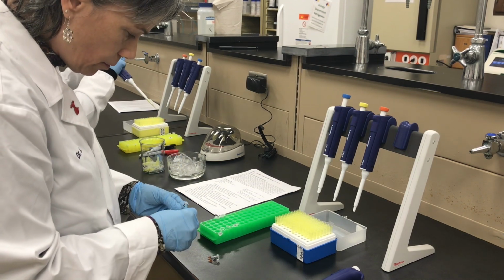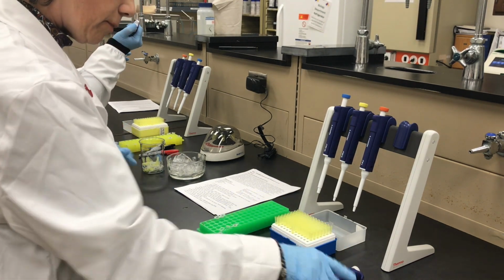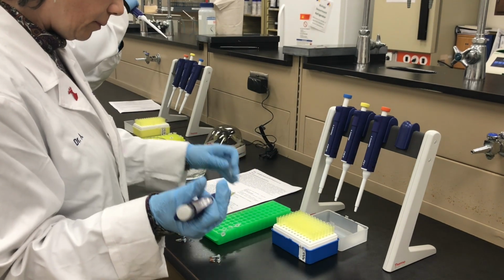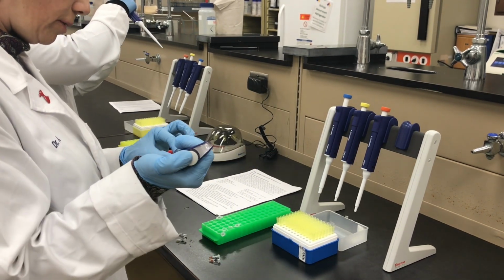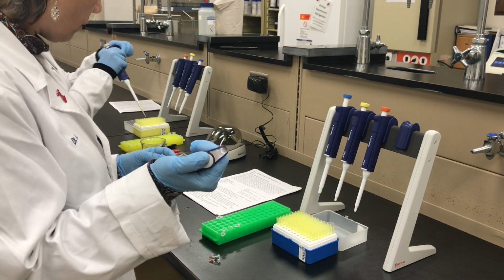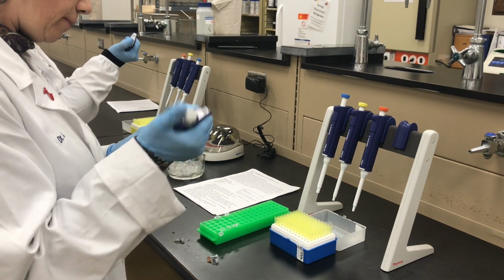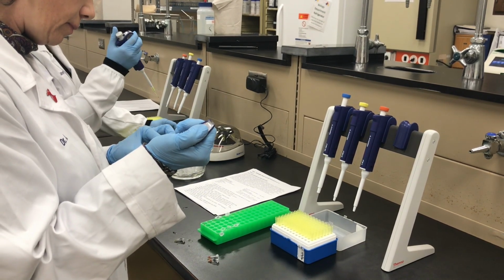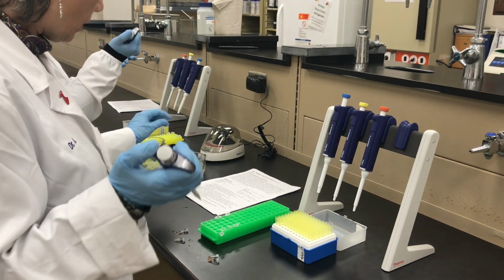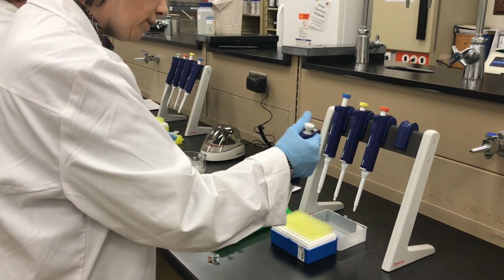There's 2. Now I got my circles, 1 and 2. So 1, C, so this is the person sample. Goes in 1. Now the control, this time the N, is going into 2.